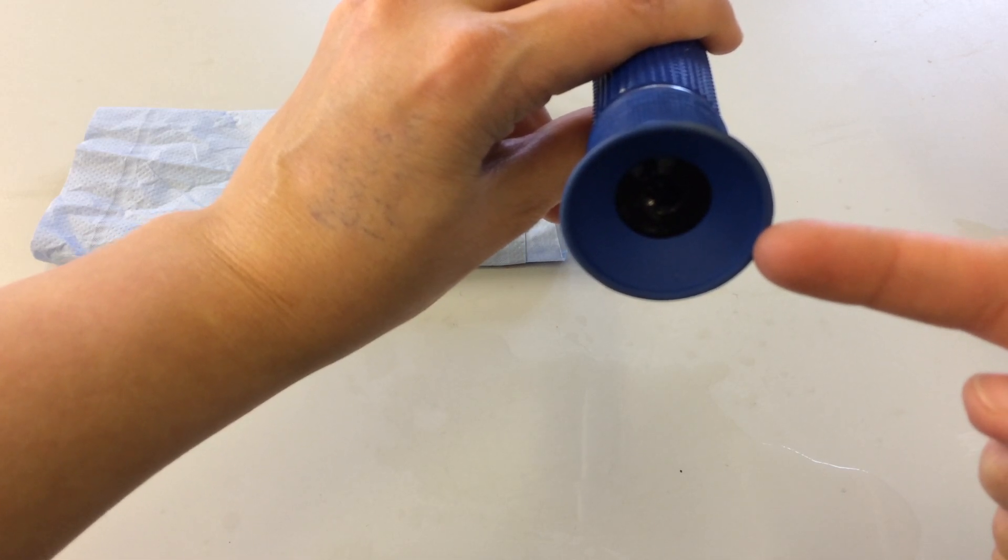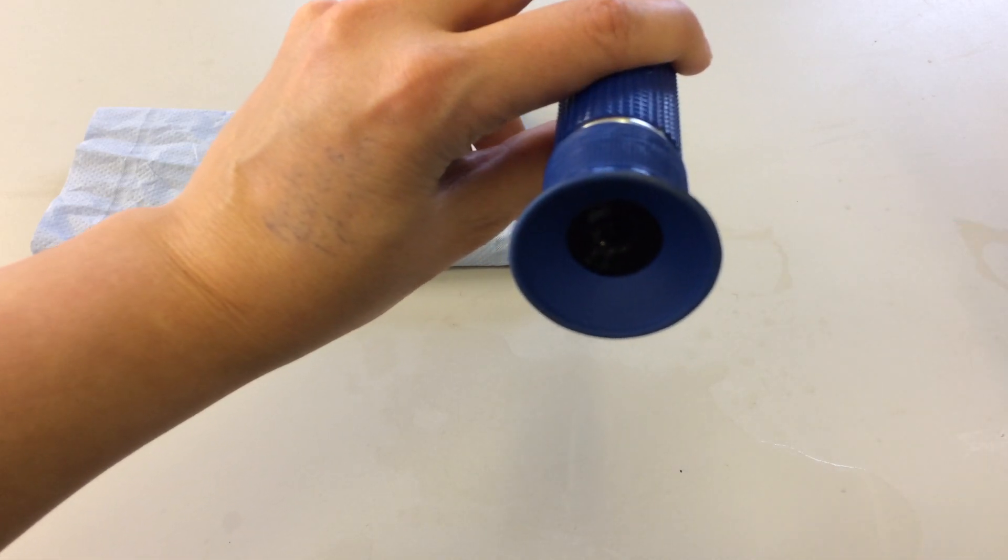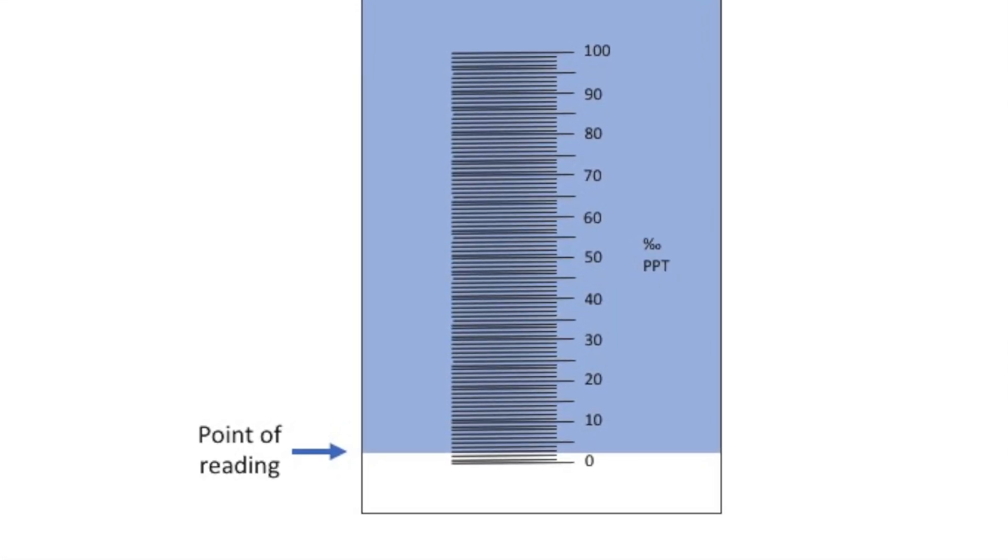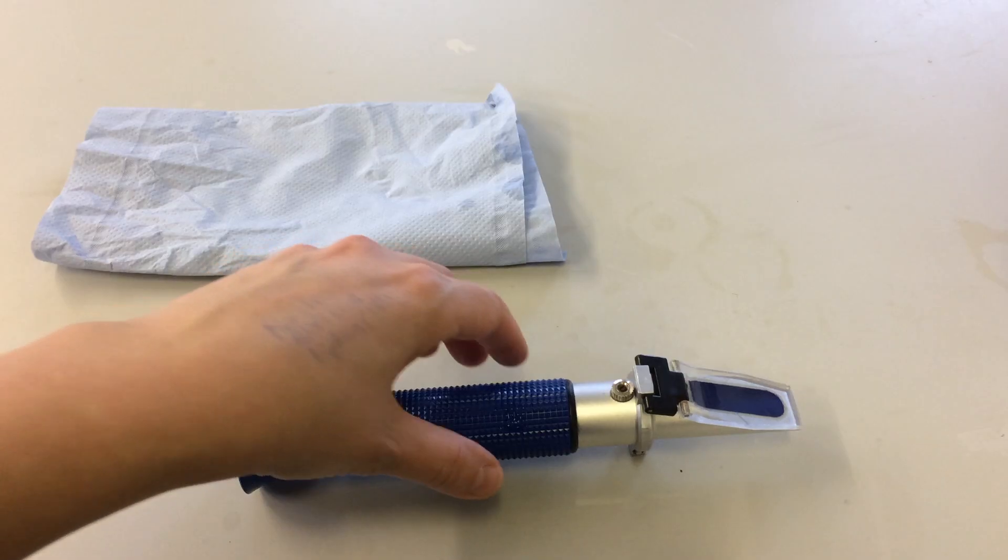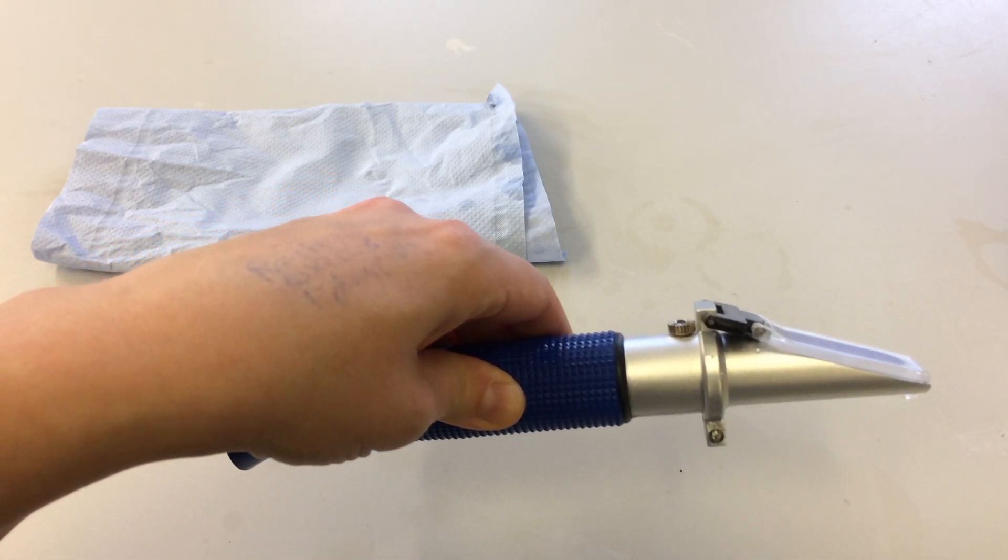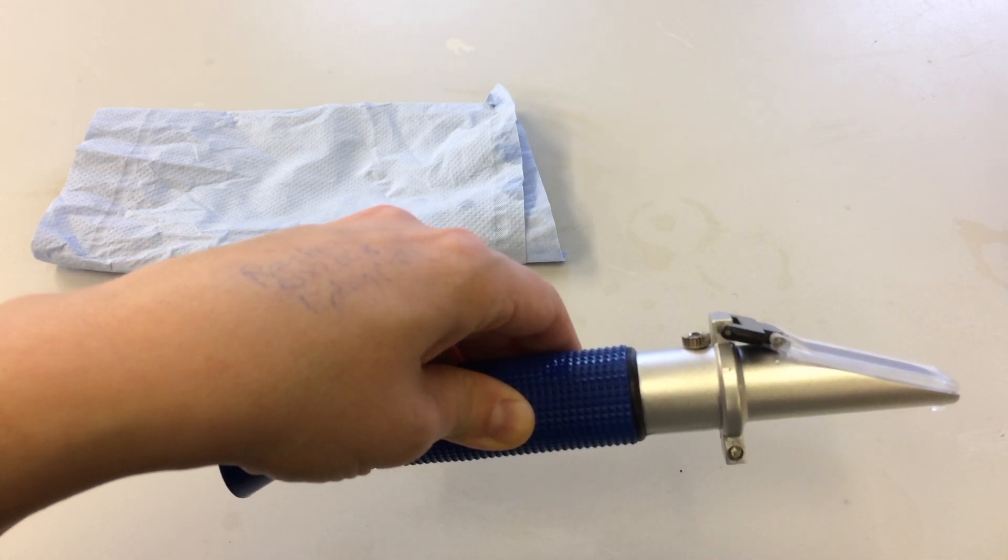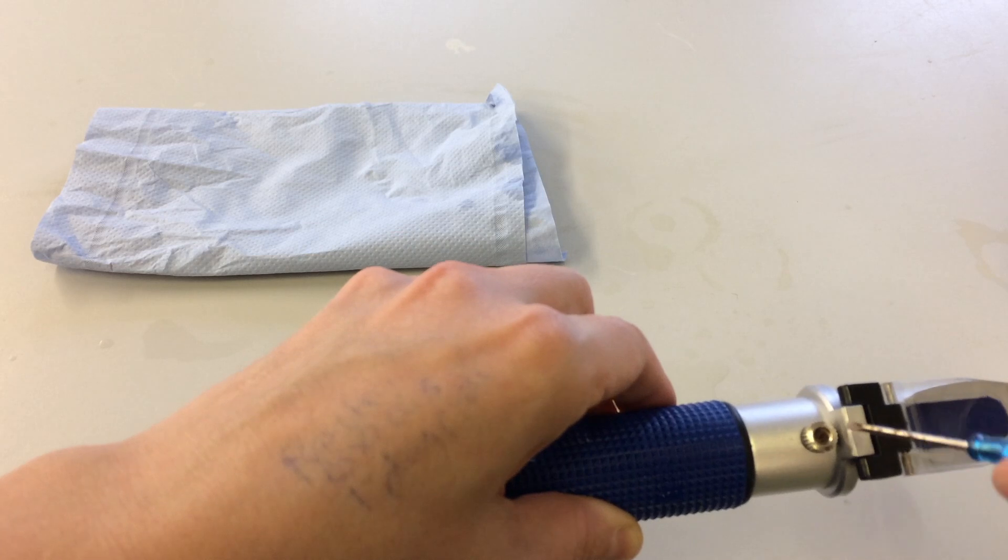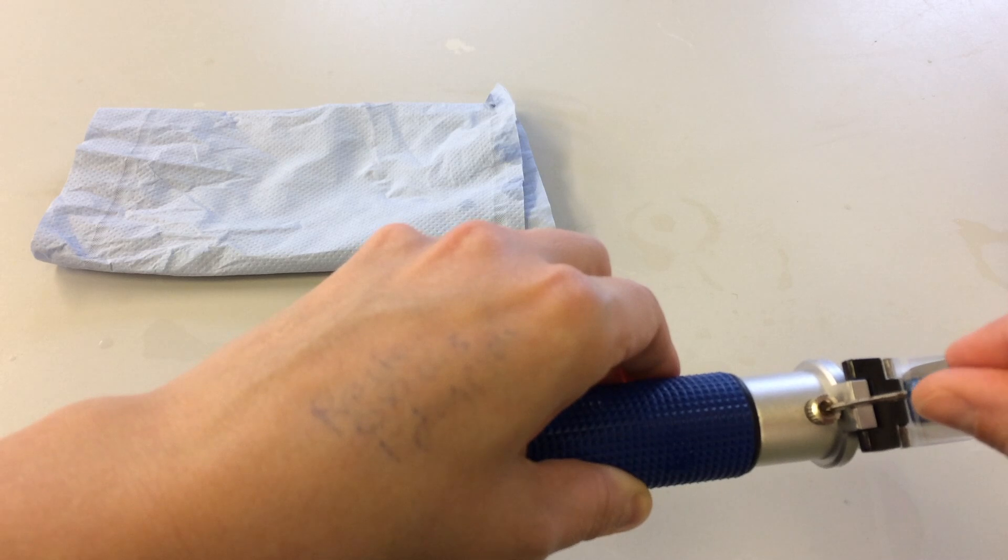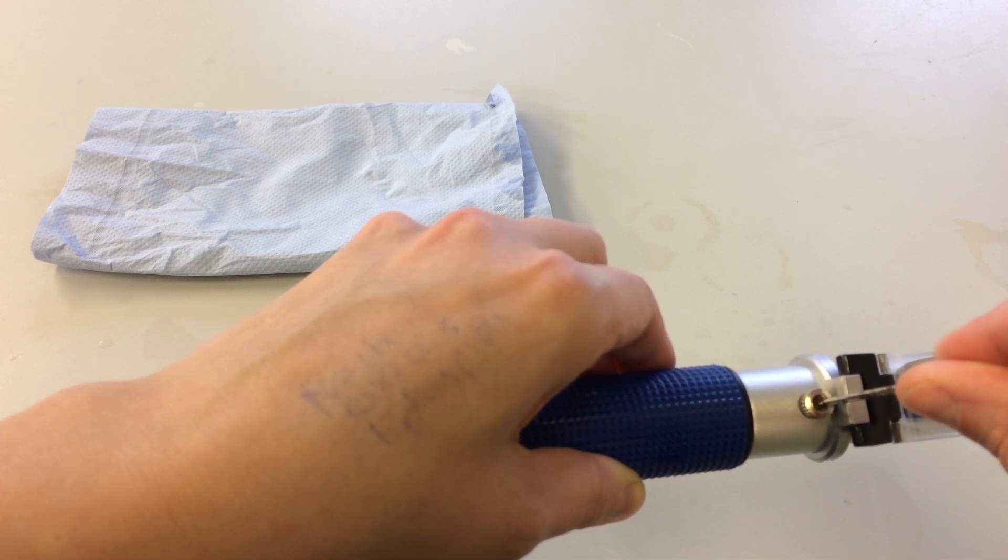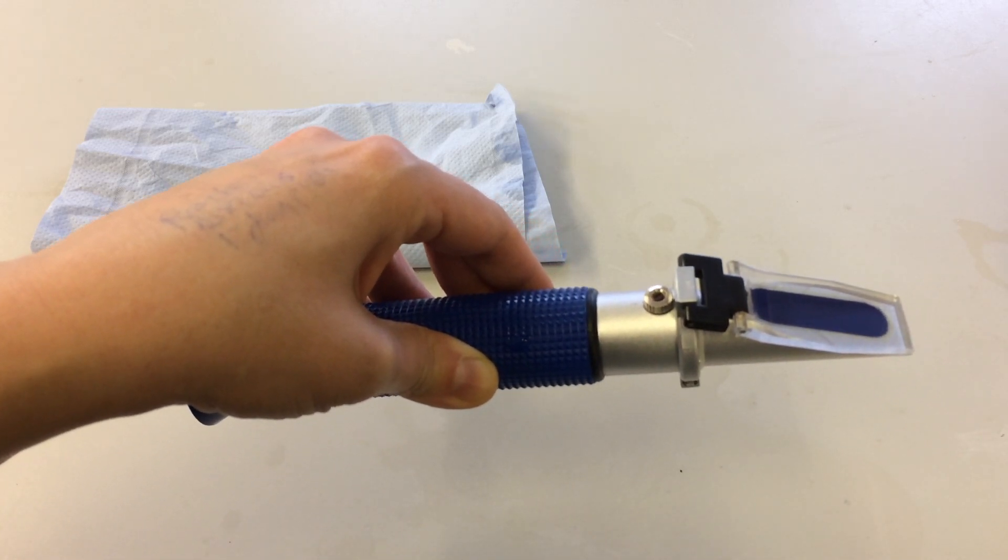We check where the lighter section and the dark blue region meet on the scale bar. If you find that your freshwater sample has not scaled at zero on your salinity scale within your eyepiece, we need to adjust this by using this calibration screw here. Literally, while you're looking through the eyepiece, just very gently adjust with the screw until that level meets at zero, and then your refractometer is calibrated.